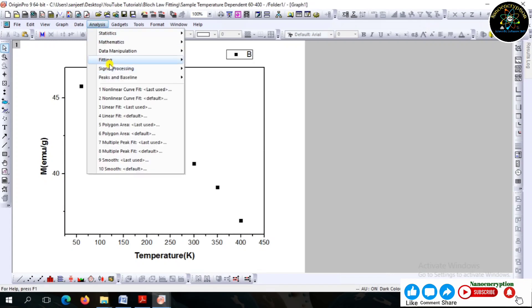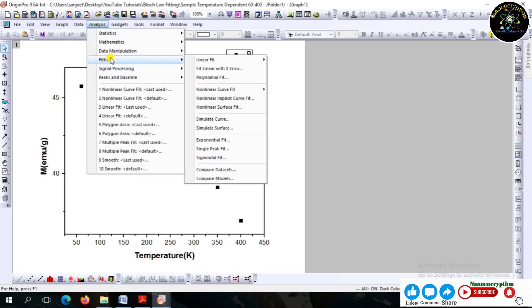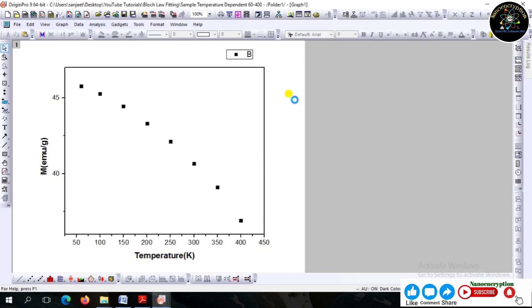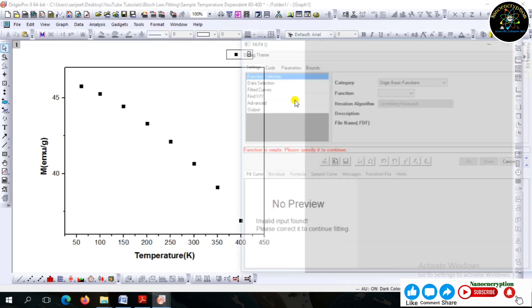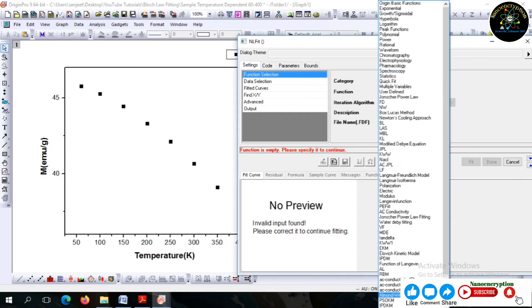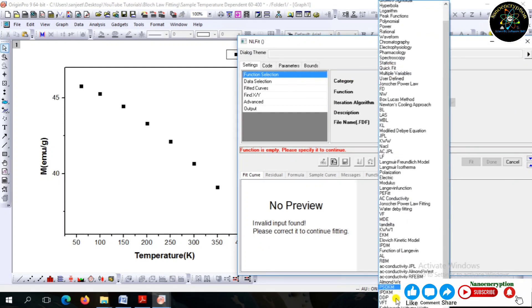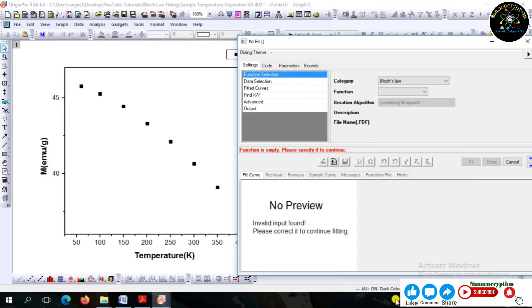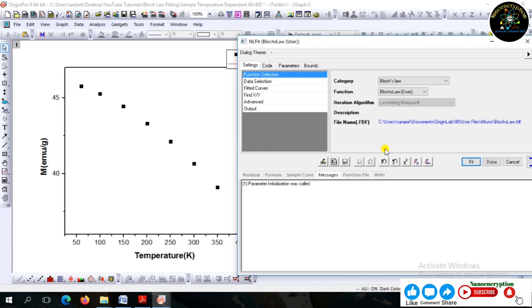After building up the equation for fitting, go to the Analysis Tools function. From here, just follow every step precisely and carefully.